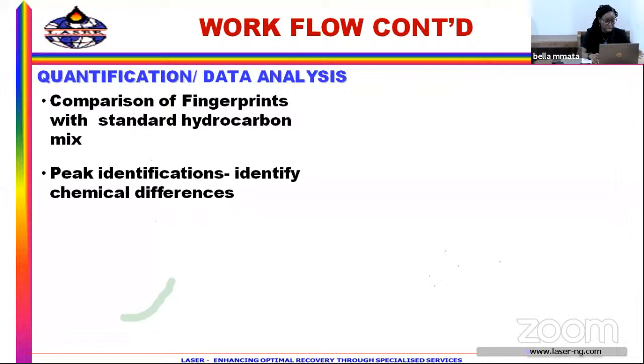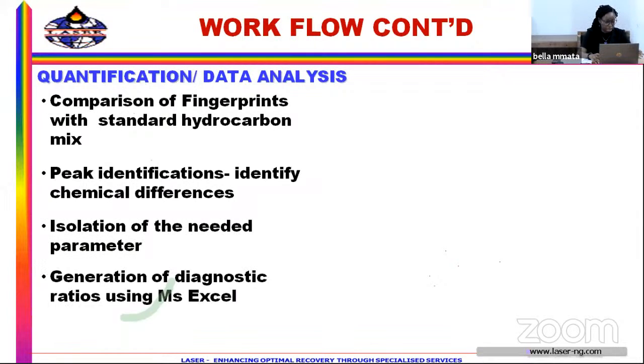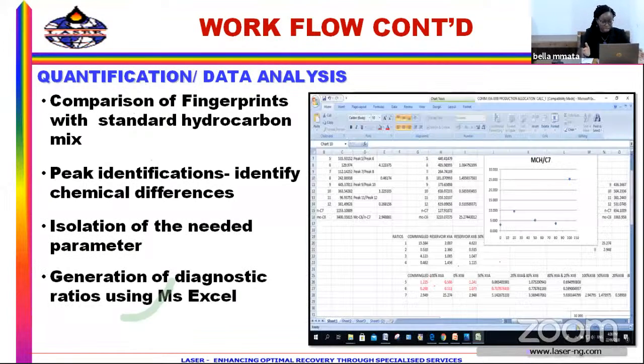So for the GC analysis, of course, we had a method which I will not bore us with. About 0.5 mils of these samples were collected from the sample bottles, the vials, using an automatic sampler and then injected into the GC for analysis. And the runtime was about 90 minutes.